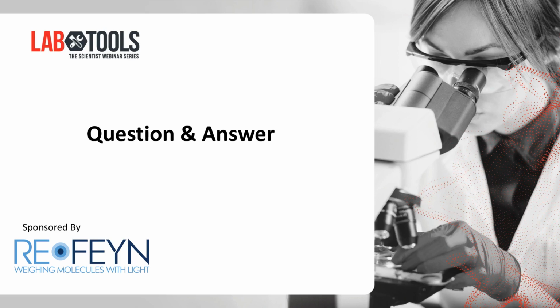Yeah. Okay, great. Sorry, questions are coming in quite rapidly. I want to make sure I don't miss out on any. For IgGs that have high monovalent affinity, you would expect each Fab to be able to cross-link to two separate S trimers, which would have the potential to lead to large aggregate species. Do you see this by mass photometry?